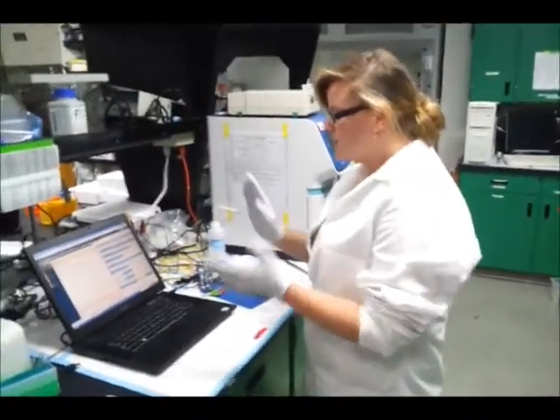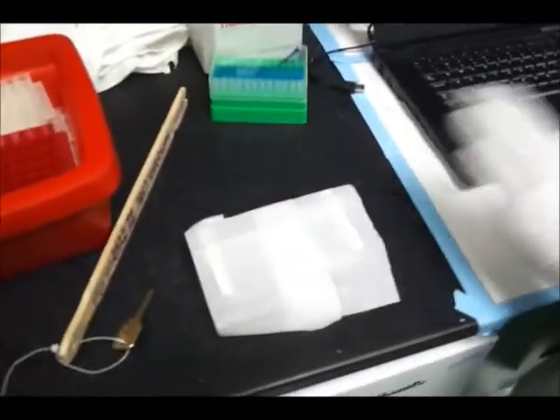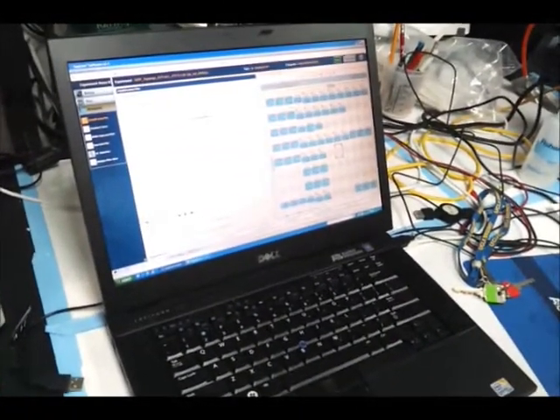So now we are going to set it all up on the machine here. I've got this guy covered for the moment. Let's start. So here's what you'll do. You want to go to new experiment. Well, actually, let's start from 0.